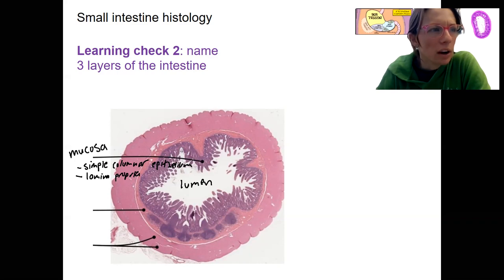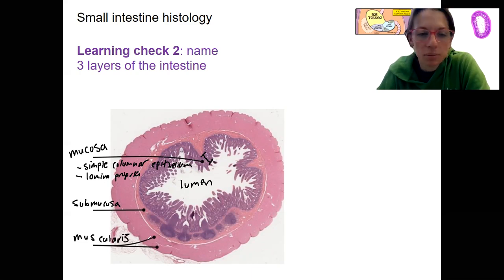Then we've got our submucosa, that's this pink here, so this is our mucosal layer. Submucosa, we're going to have some glands in there that we'll talk about. You can see some specialized lymphoid tissue here. Then we've got our muscular layer. Muscularis externa is what this is. There is a couple of different layers of muscle.